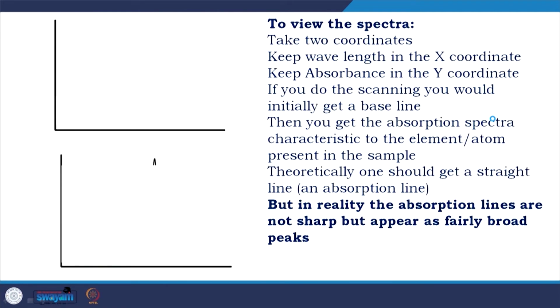So, to view the spectra, you have to take two coordinates. See here, I have taken two coordinates. I put wavelength on the x coordinate, I put absorbance on the y coordinate.